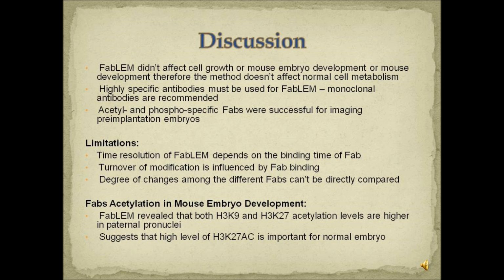Therefore, monoclonal antibodies are recommended for better control of FabLEM experiments. Only acetyl and phospho-specific Fabs were successful for imaging in pre-implantation embryos. This could be explained by different affinities of Fabs. There are several limitations to using this method.